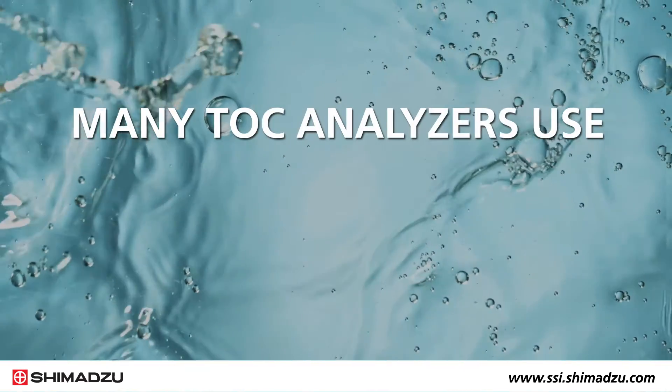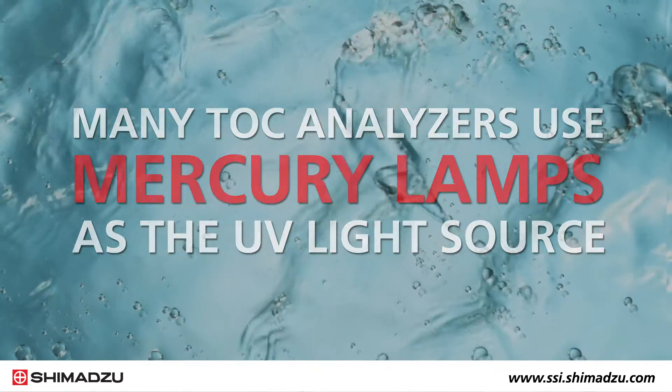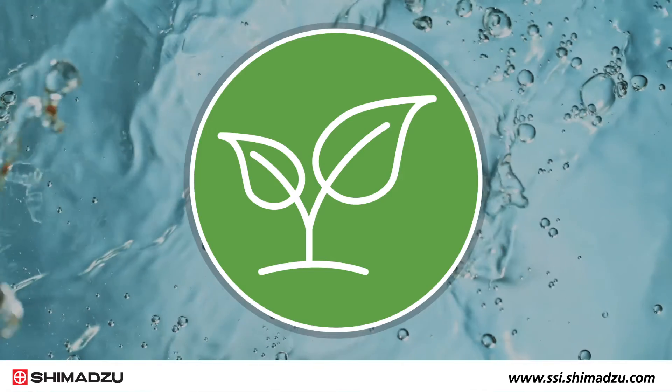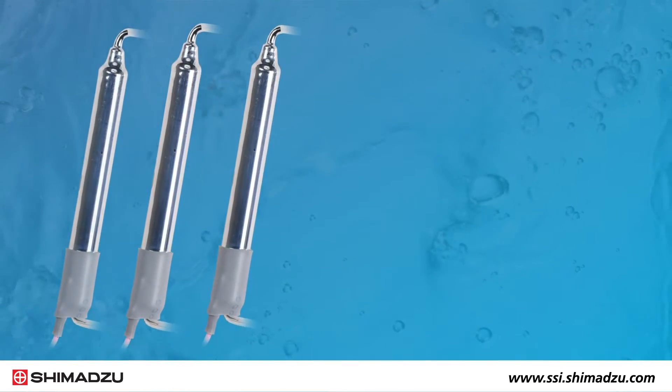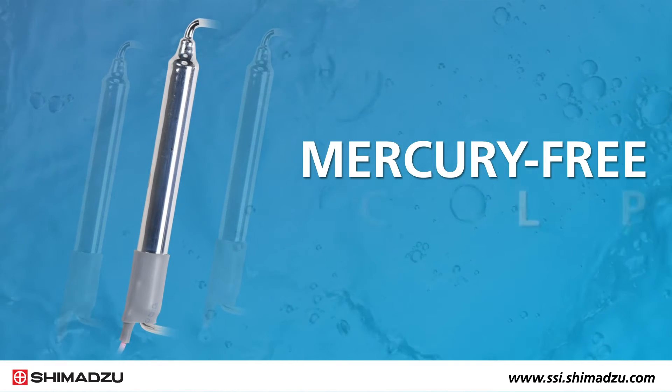Many TOC analyzers for pure water use mercury lamps as the UV light source within the instrument. To improve environmental sustainability, the TOC1000E is the first analyzer in the world to feature a mercury-free excimer lamp.